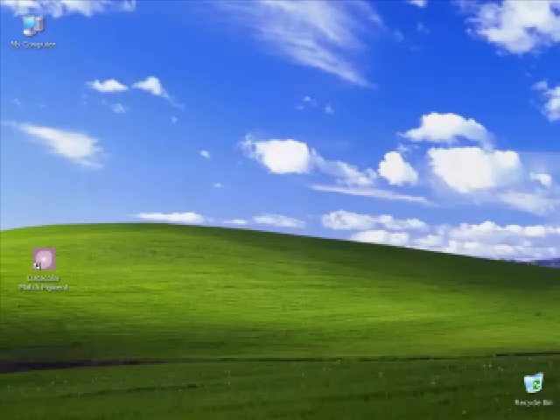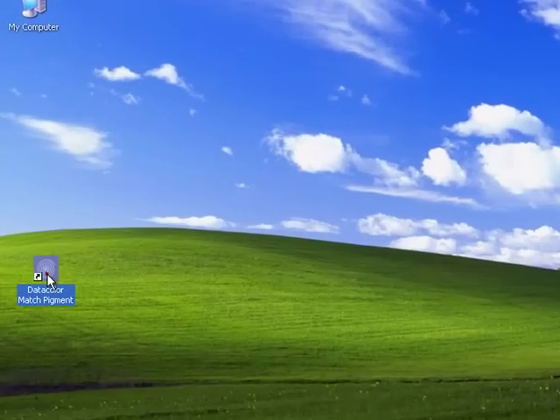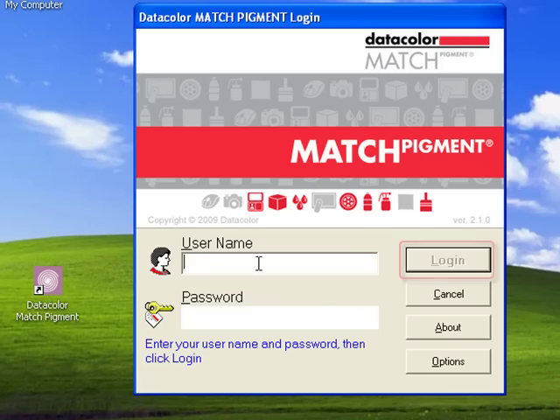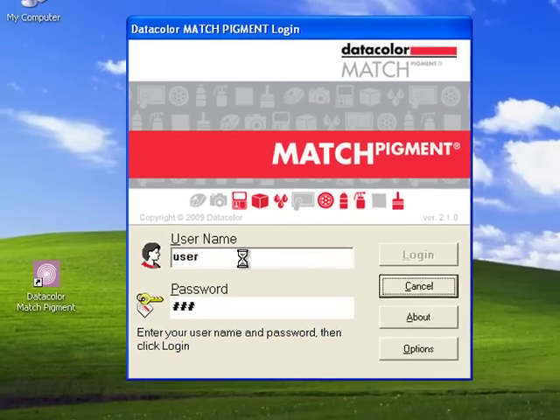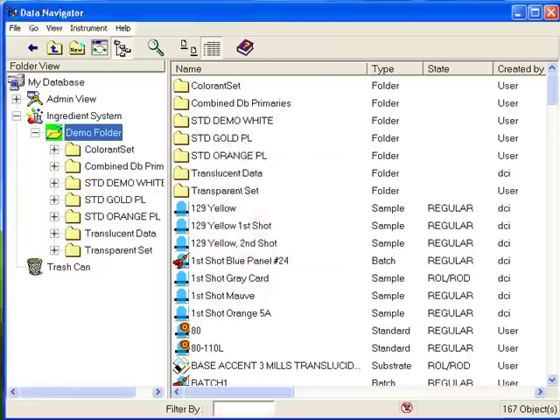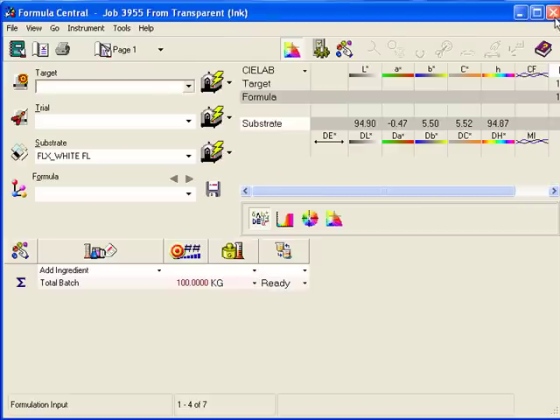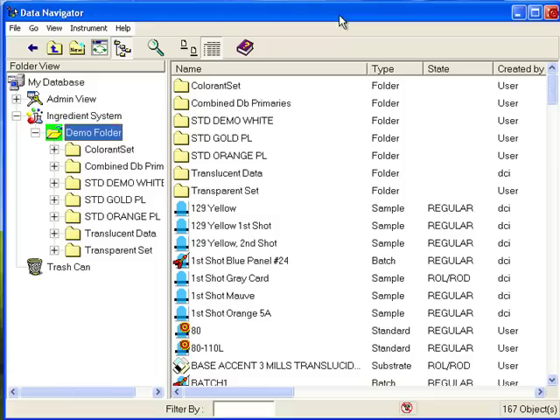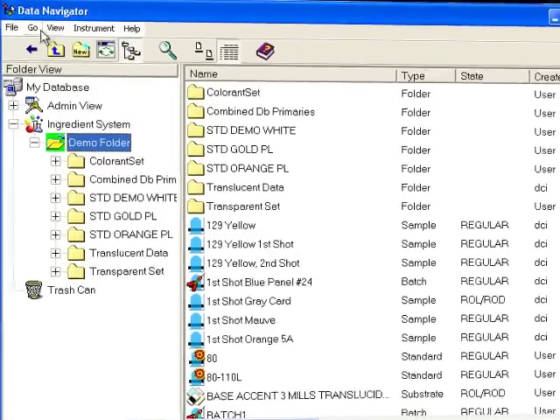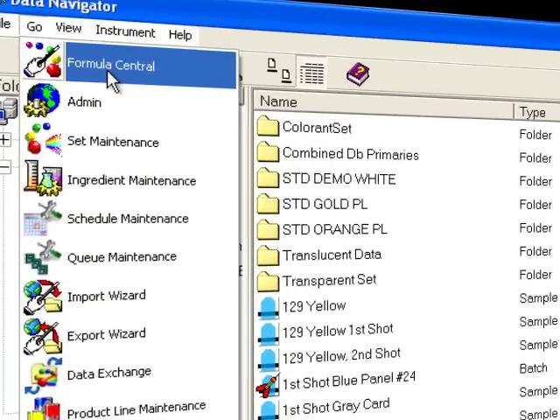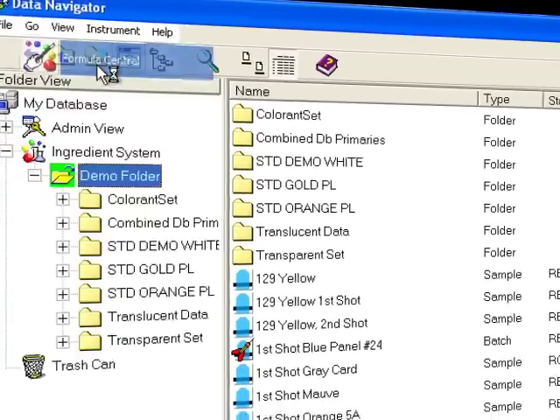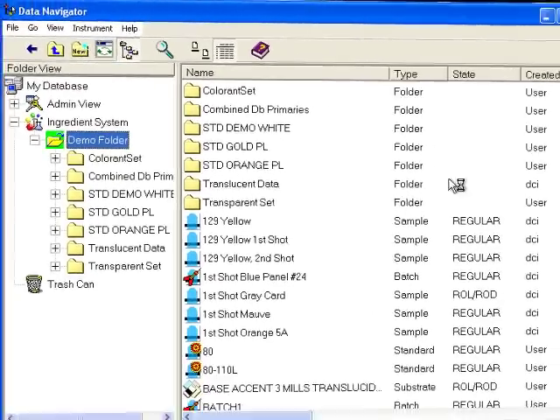Find the program shortcut to Datacolor Match Pigment on your Windows desktop and open it to log in. Formula Central may be configured to automatically start, as you see here. If not, simply use the Go menu from Data Navigator.